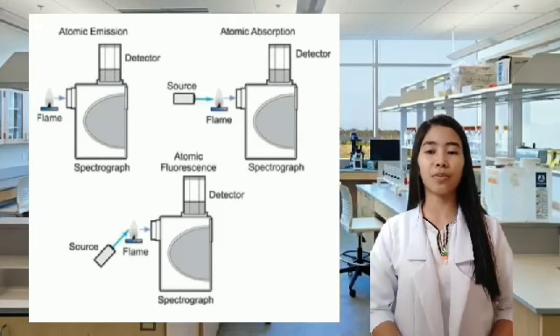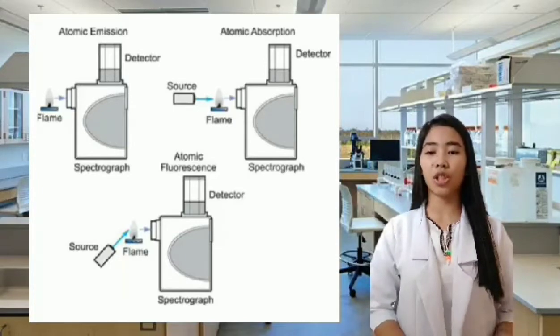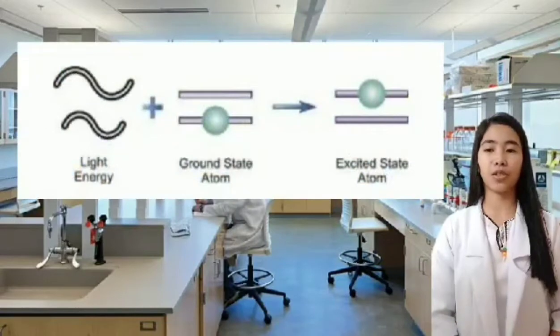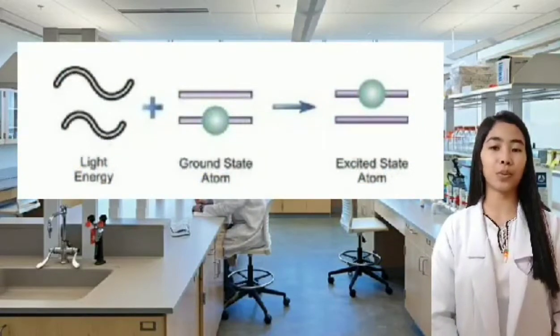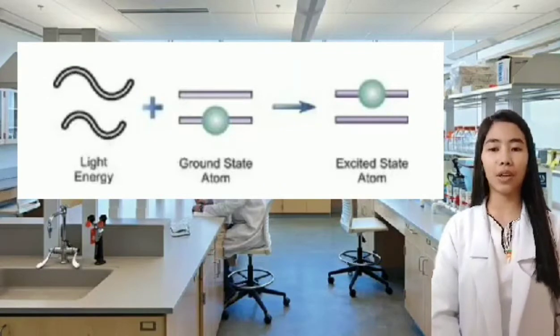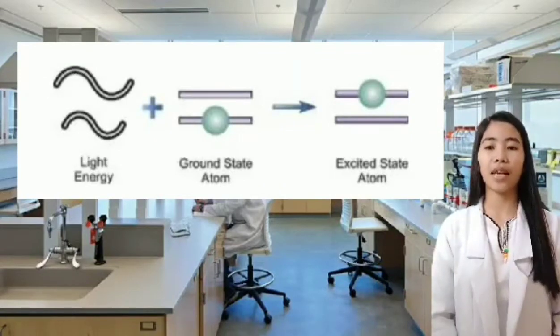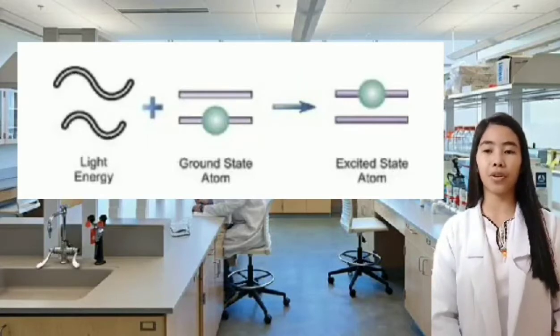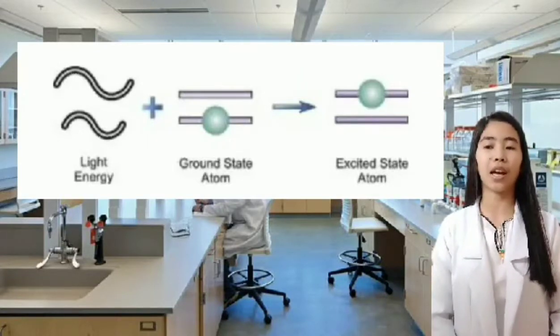The emission spectrum of an element exposed to such an energy source is a collection of the allowable emission wavelengths. So atomic absorption measures the amount of light at the resonant wavelength which is absorbed as it passes through a cloud of atoms. As the number of atoms in the light path increases, the amount of light absorbed increases in a predictable way.